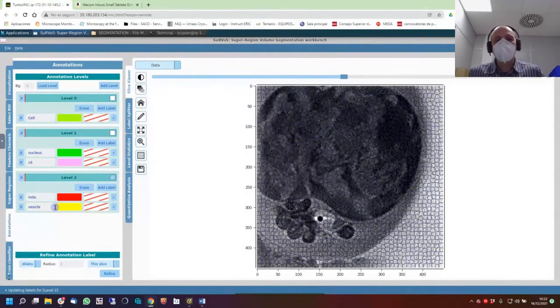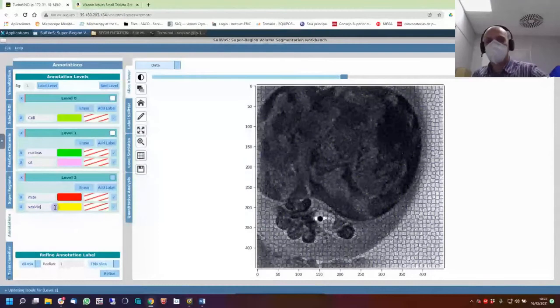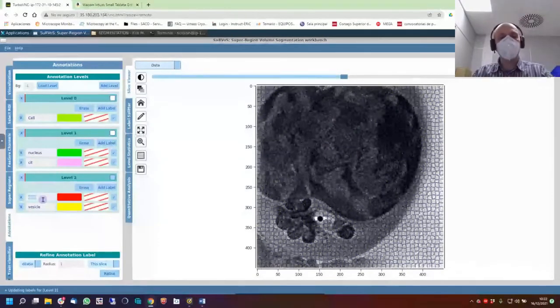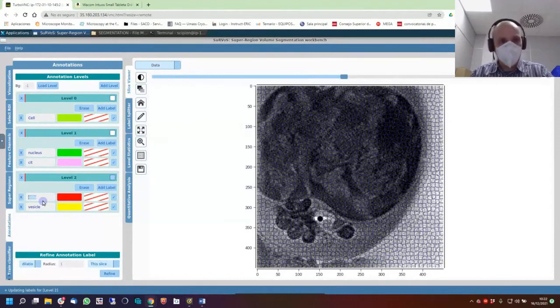The name that we are going to extract will keep this nomenclature, but it will not follow the name that you put. When you extract it, you will not have this name, but this name will be inside the HDF5 file that SURVOS uses.